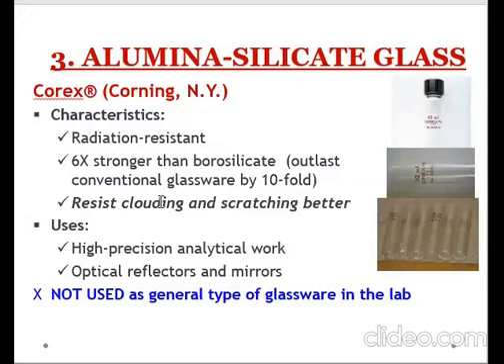Okay, in terms of use, it can be used in high precision analytical work, and in optical reflectors and mirrors. Kaya di ba napapansin niyo yung mga salamin, hindi siya madaling ma-scratch. Okay? So, ano yan siya? Aluminosilicate glass. No? Most probably Corex ang brand.